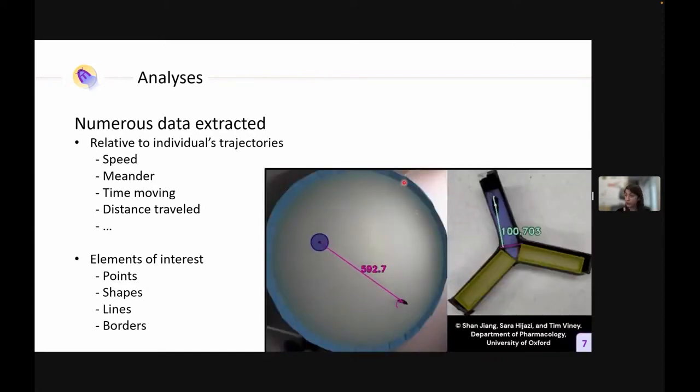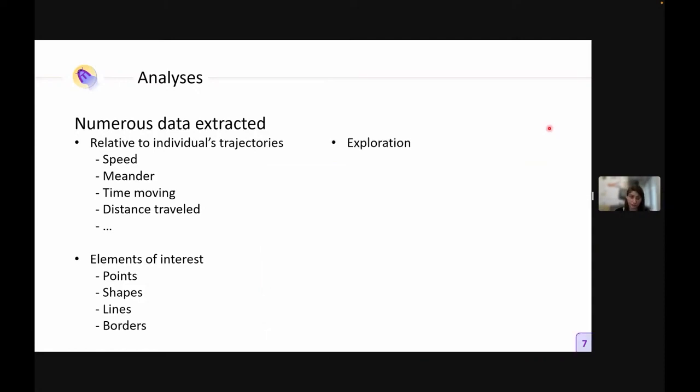So here is an example of one of our users. Thank you very much to them who accepted to share this video. They are doing experiments with mice. So you have here a typical Morris water maze, and a Y maze. And as you can see, you really have something that's defined by you. You can put your point of interest wherever you want. You can use the shape you want, the size you want. It's really flexible to a lot of different studies, I believe.